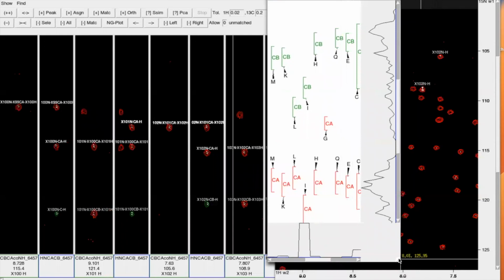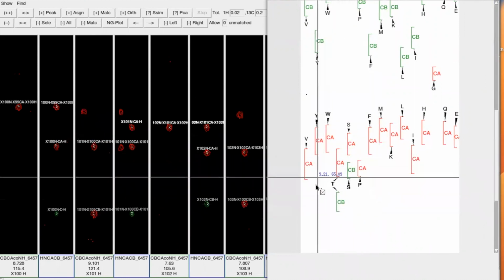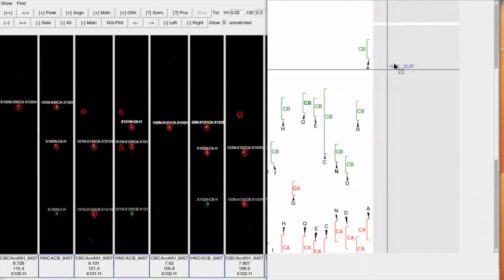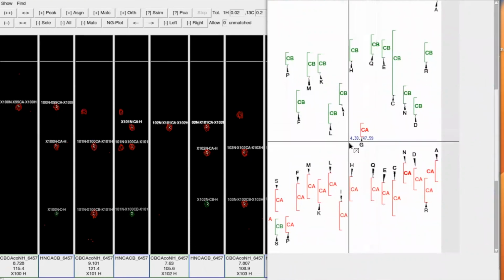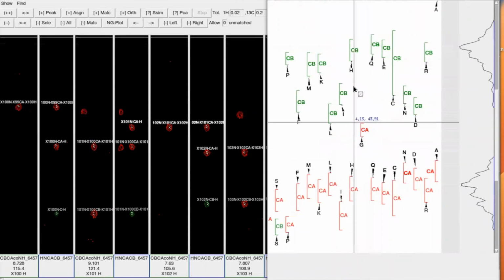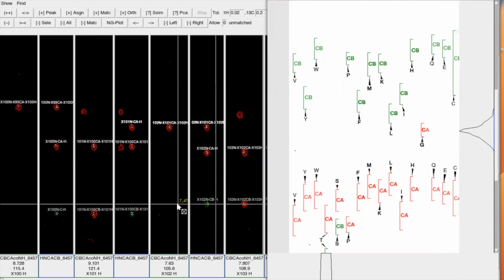From here, it is really important to know some special amino acids. First, there is the threonine and the serine, which have very high carbon beta chemical shifts compared to other amino acids. Additionally, there is alanine, which has a very low carbon beta chemical shift compared to the other amino acids. Lastly, glycine has a very low carbon alpha chemical shift compared to the rest of the carbon alphas for the other amino acids. And additionally, glycine does not have a carbon beta chemical shift. Knowing these four special properties of these amino acids helps a lot in assigning within the sequence.